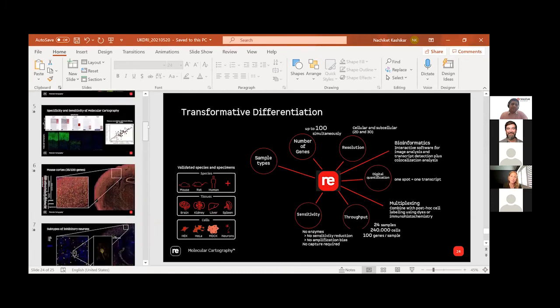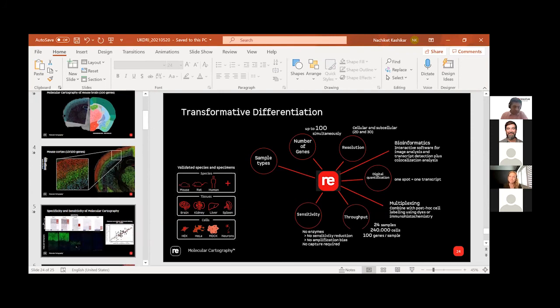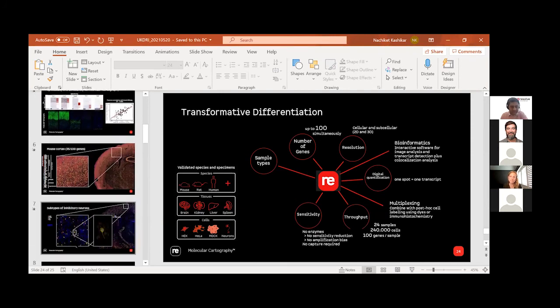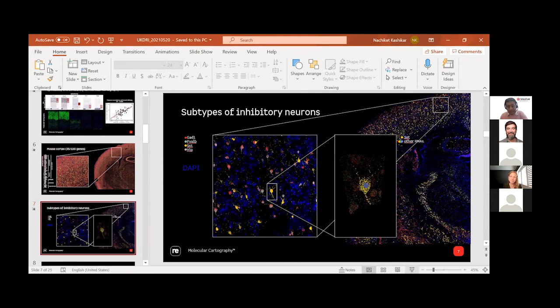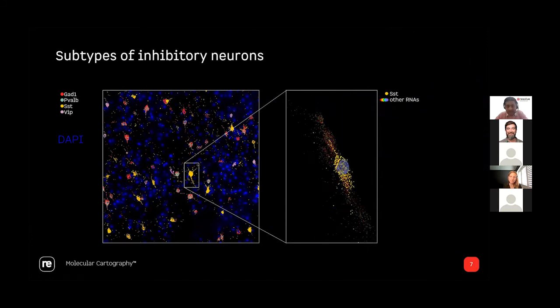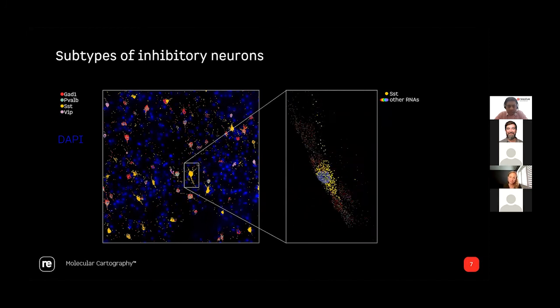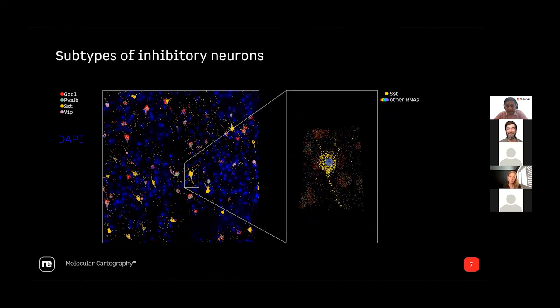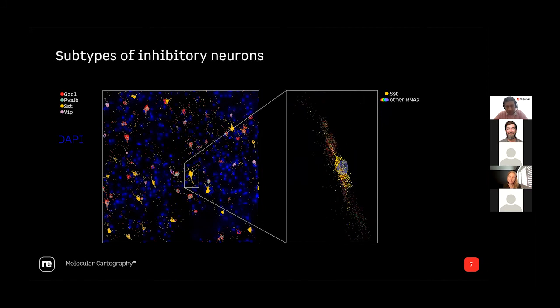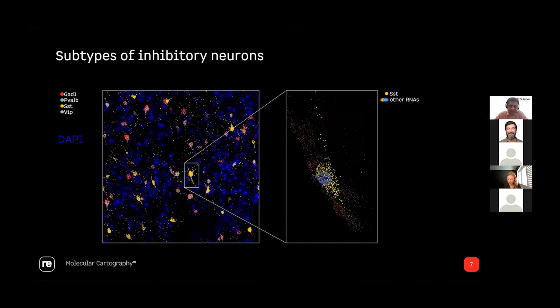So, we don't have that resolution to really track the neurites. That's absolutely sure. Of course, we are not doing any expansion and all that stuff. So actually, I was surprised that we even see this sort of stuff. It was really a pleasant surprise for me. My background is neuroscience, and I was really happy with this. And maybe the density of the spots is quite high closer to the cell body. That's one of the possible reasons. If you really want to trace axons and dendrites, I think you need to have expansion to a certain degree, but we are not claiming that at this stage. Yeah. Okay. Thank you.